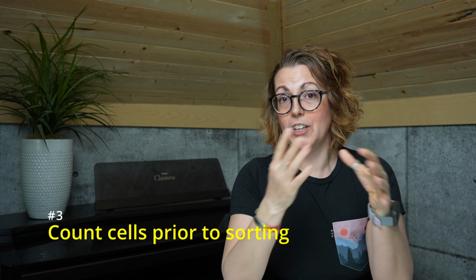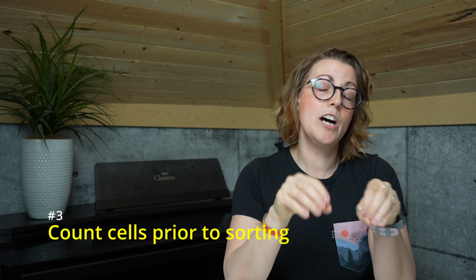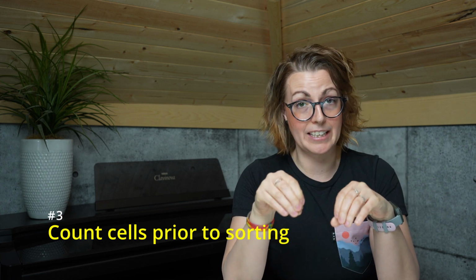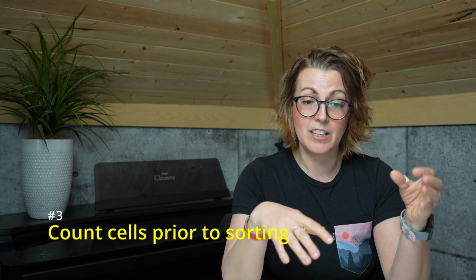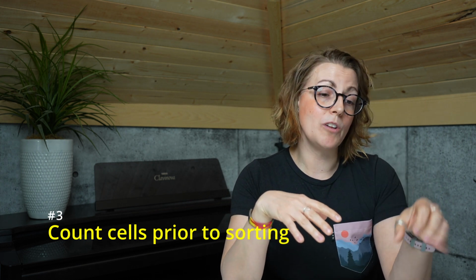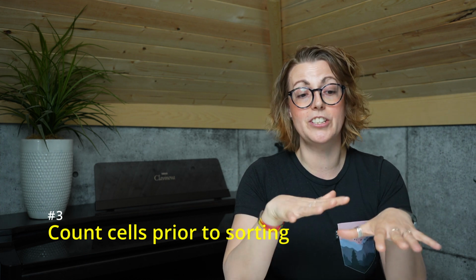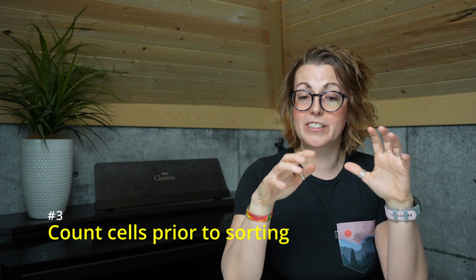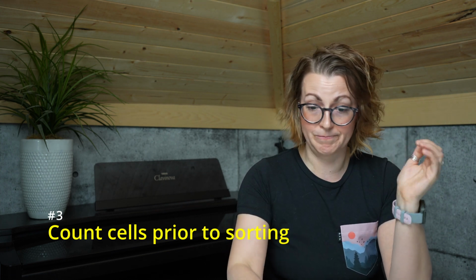Third up, and along the lines of the concentration theme I was just talking about, count your cells prior to sorting, not prior to staining, when determining your final volume to resuspend your cells in. A fair number of cells can be lost during the staining process, and as we talked about previously, cell concentration is an important part of the sort. So you want to be calculating your cell concentration with the count that is going on to the sorter.